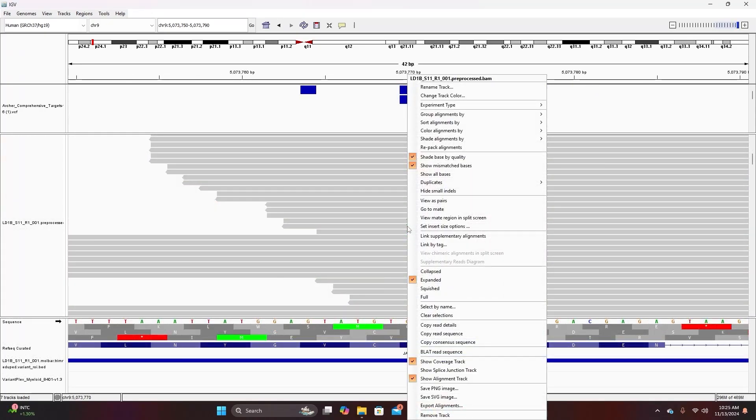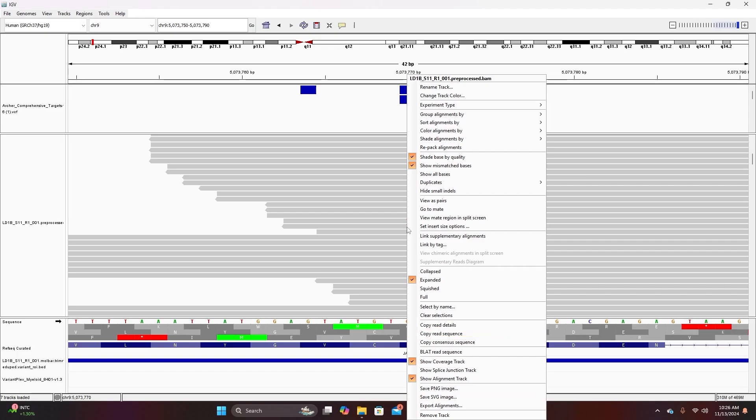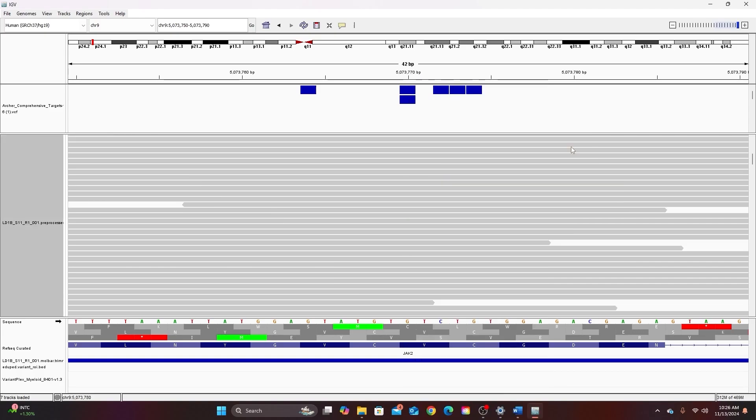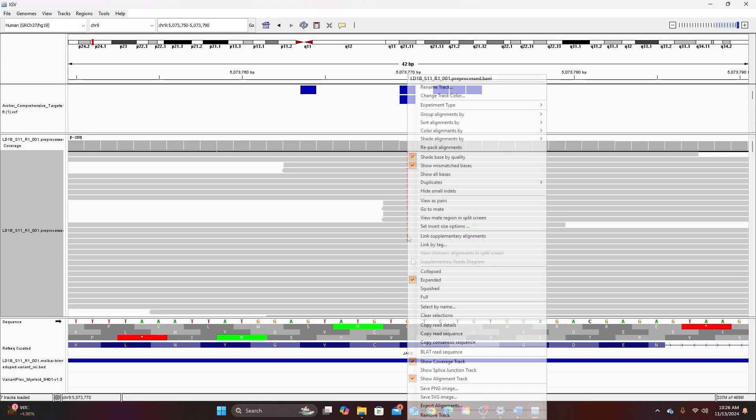So when I right click on the alignment you can see that there are many different options for sorting or coloring the alignment that bring out different features that I might be interested in. So for example I could go to sort alignments by and sort by base. Because I have the alignment centered on this T now all the T's are brought to the top of the alignment and all the G's which are not shown because they match the reference genome lie below.